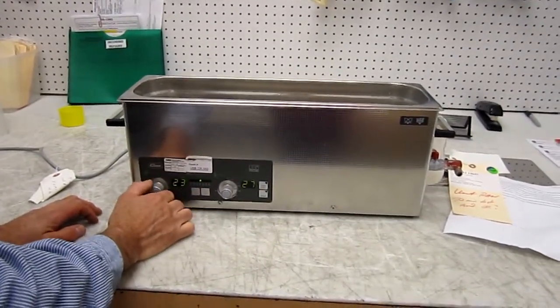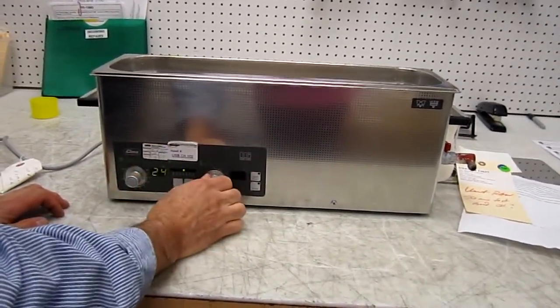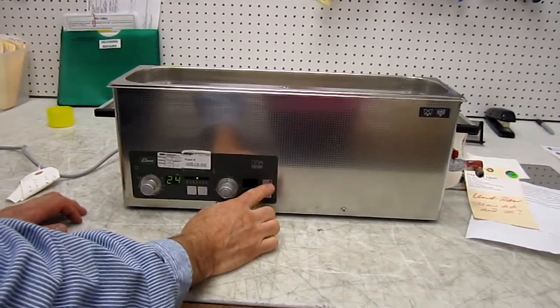This is the temperature set. I'm going to set that for zero because we're not going to be running a temperature. This is temperature, this is time. This is the amount of minutes it's going to run. After you've selected your power, you simply just hit start.